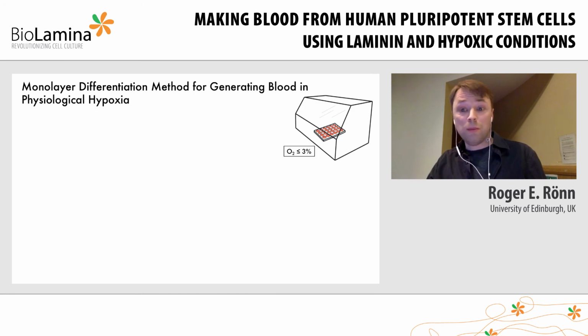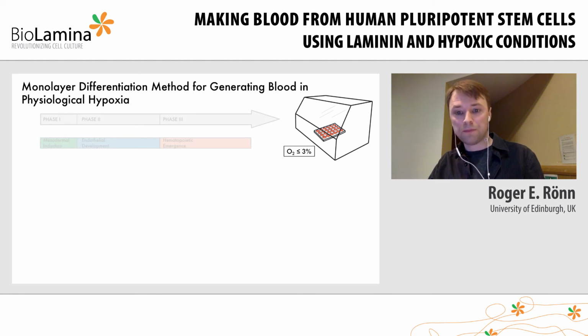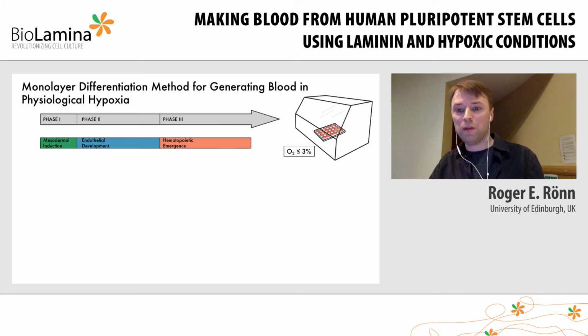Since my work is still unpublished, I cannot go into too much detail regarding the design of the blood differentiation protocol that I am developing. But described in a simplified way, my new system features a three-step approach where in the first step, a monolayer of HPSCs are instructed to start differentiating into the mesodermal germ layer, which is the early developmental branch of cells that consists of the precursors for tissues such as blood, heart, vasculature, and more.